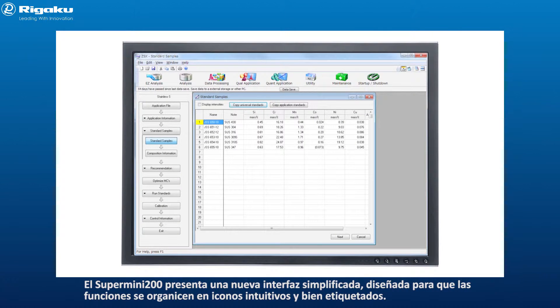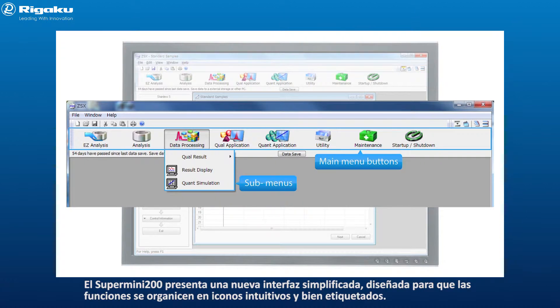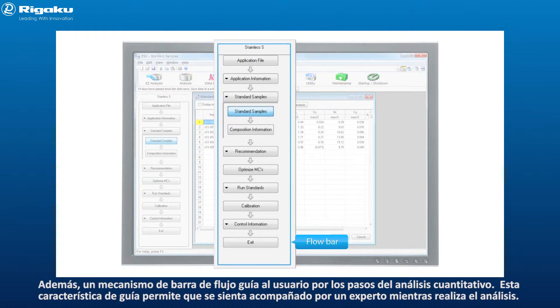The Supermini 200 has a new simplified interface that is laid out so that the functions are organized through intuitive, well-labeled icons. In addition, a flow bar mechanism guides the user through the steps of quantitative analysis. This guide feature is like having an expert sitting next to you during your analysis.